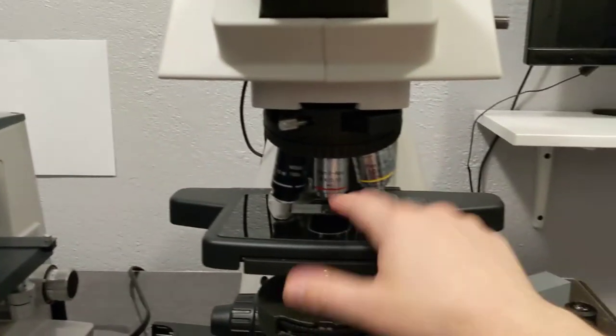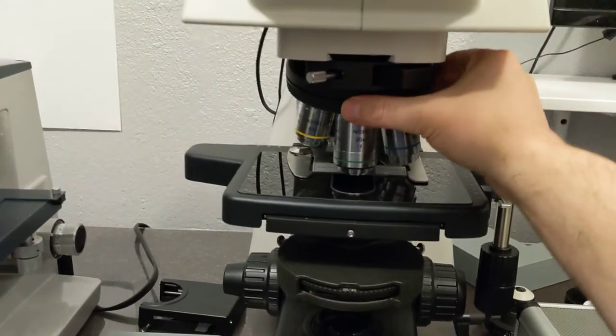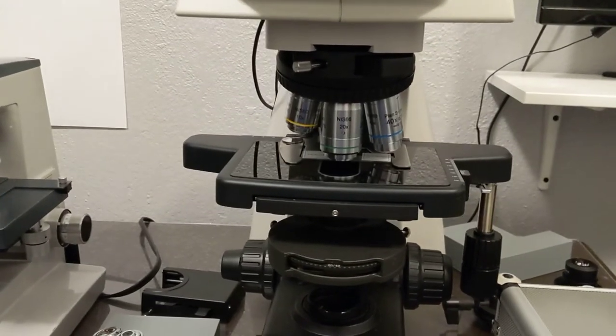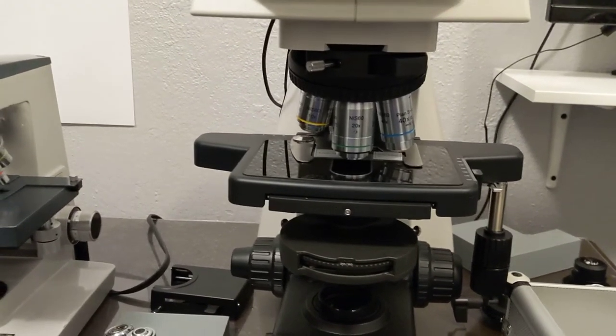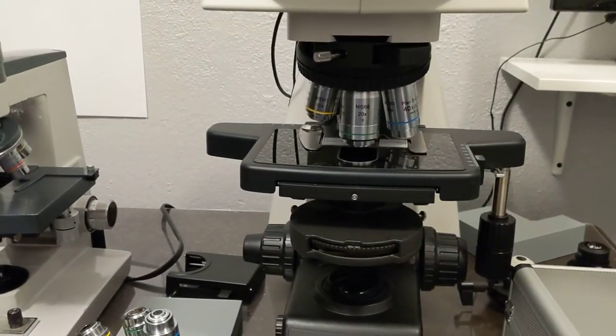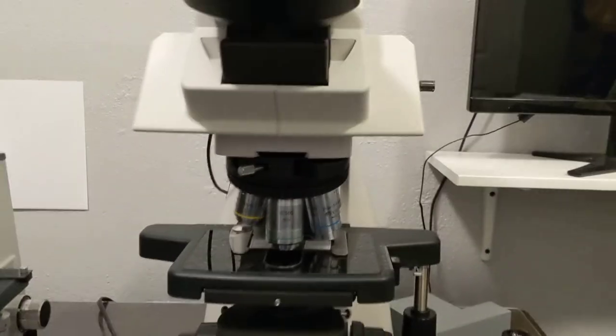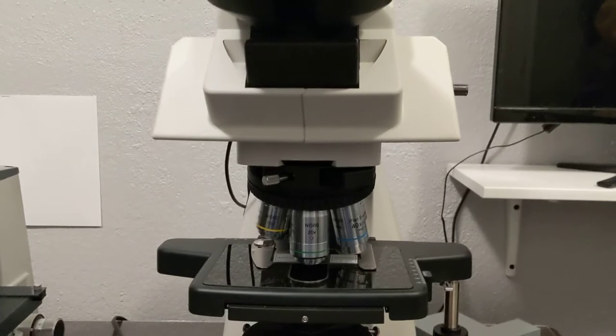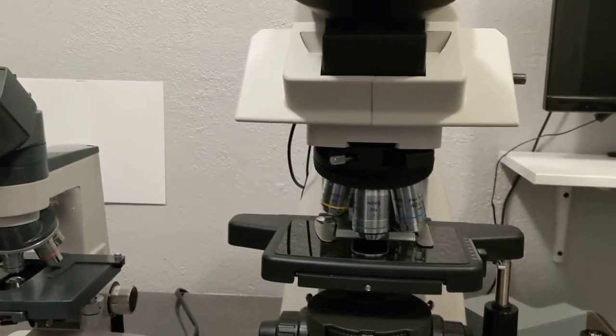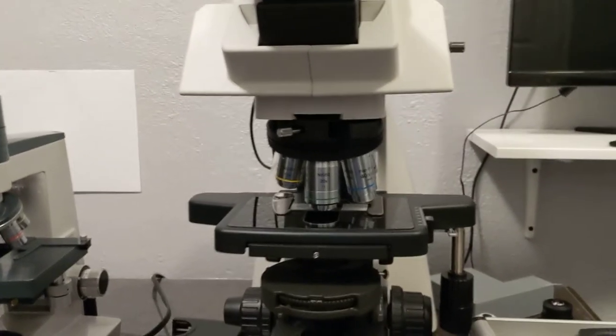This 20X Apo is a little bit custom made. If you look at it, it's wider than the other objectives. This is a six-position nosepiece, but they actually make a seven-position nosepiece. Originally, that's what I wanted, but it turns out that this 20X Apo is wide enough that it won't allow you to put objectives next to it if you get the seven-position.